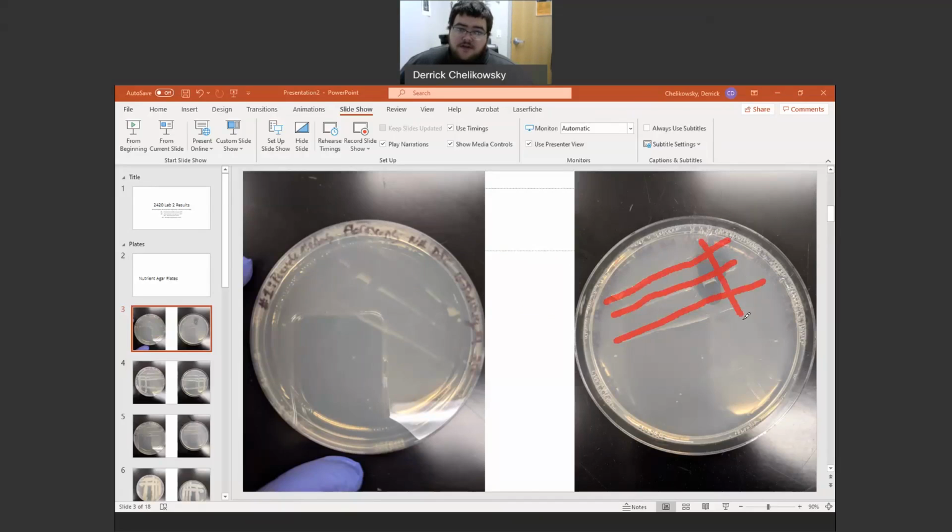Notice how I'm using the upper section of the plate. Then we have another streak here, here. I did not go back for bacteria. So after streaking, I disposed of my loop. Then down to, disposed of my loop. And then there, disposed of my loop. And if we let this grow a little longer, and you'll see with the Enterobacter in particular, you can get individual colonies towards the tailing edge.